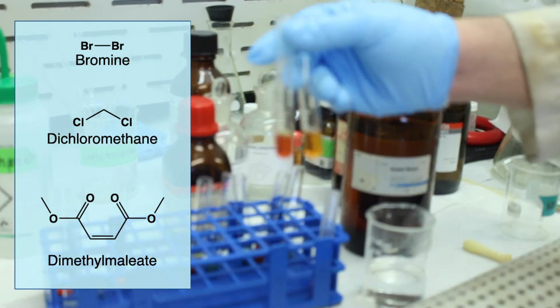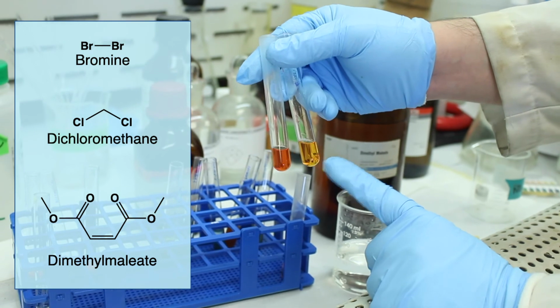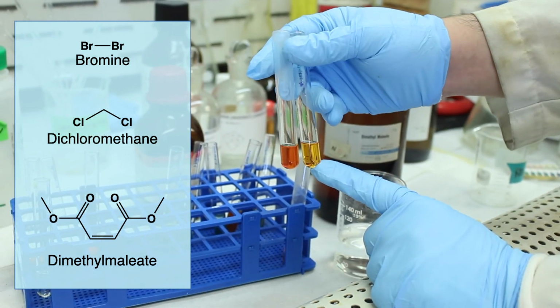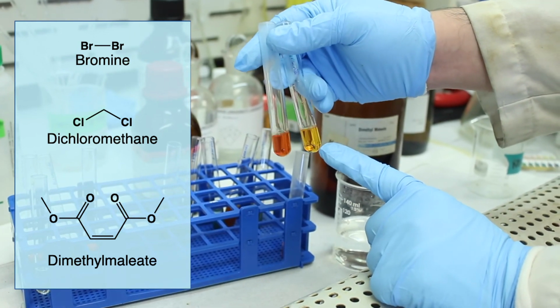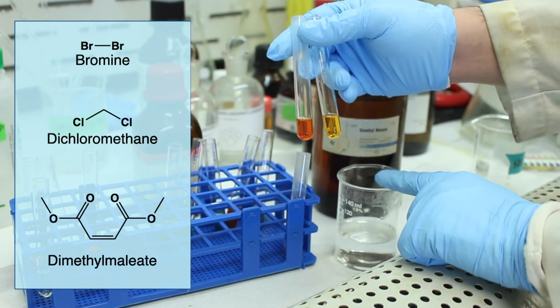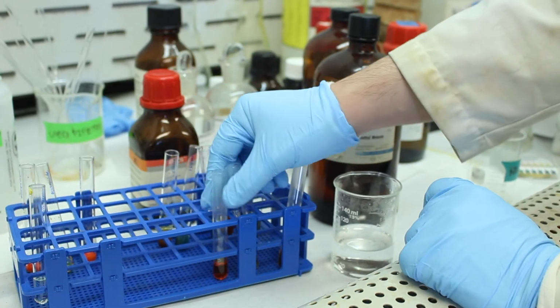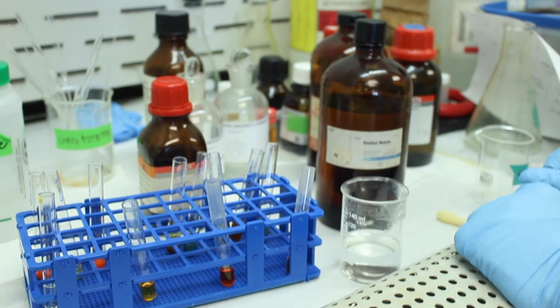So there you go. This is probably the hardest test to interpret because these are very similar, but nevertheless, the dimethyl maleate tube is a little lighter in color. It's more yellow than red, and this indicates that some of the bromine was consumed. If there's a consumption of bromine, that means that there is a double bond present, and we needed heat. So that tells us that there's an electron withdrawing group on there. So yeah, hardest test to interpret. So positive test, but difficult to observe.